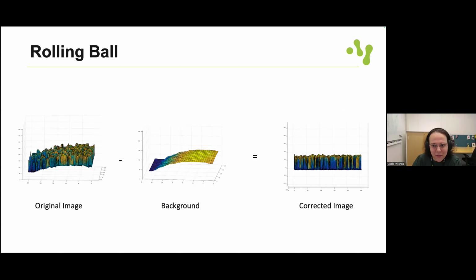Well, we talked about the basics of digital images and some tools like the histogram and how to play with contrast for visualization or pre-processing, for instance. And we covered some image artifacts that can or cannot be corrected with image analysis. So now that we have this background, we can go a bit deeper into the steps of pre-processing and enhancement.